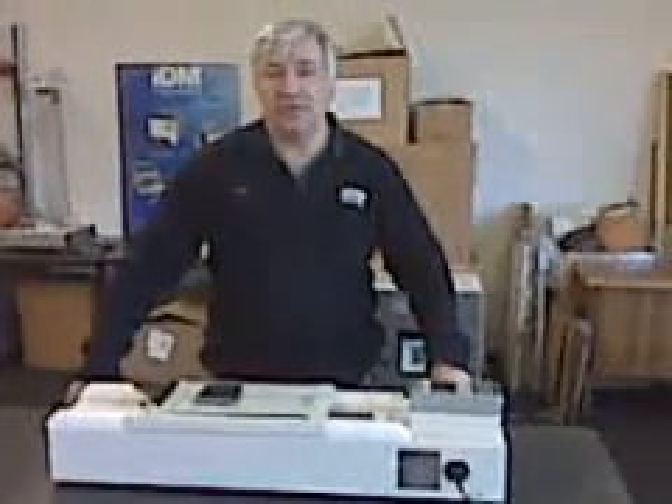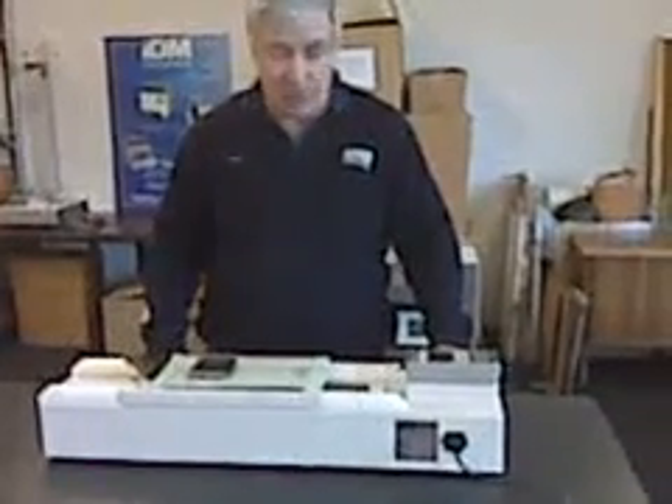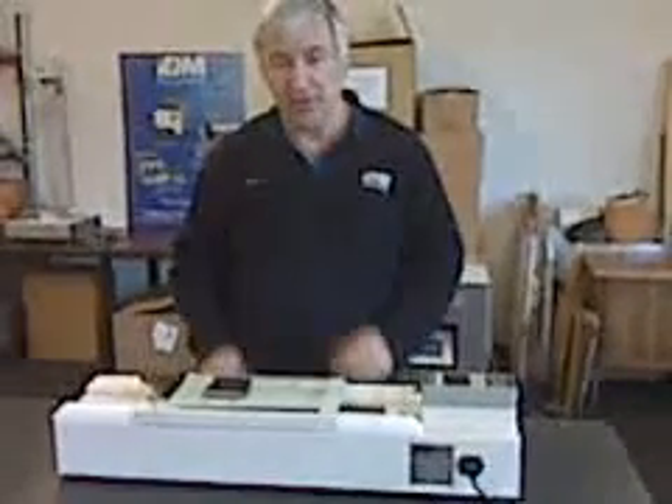My name is Ben and I'm a service and quality technician. I will demonstrate to you how to calibrate the CIF tester.